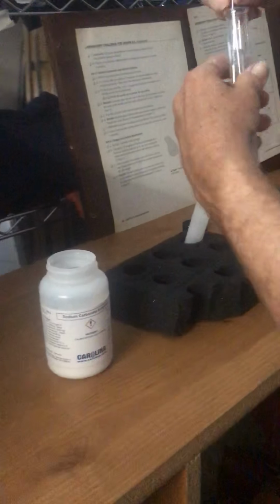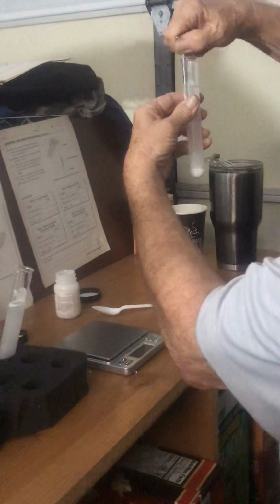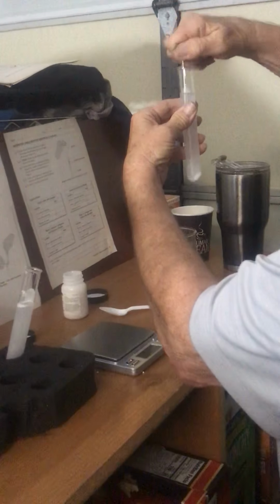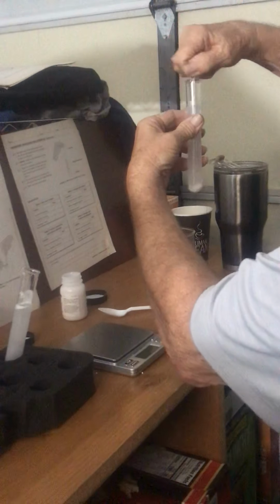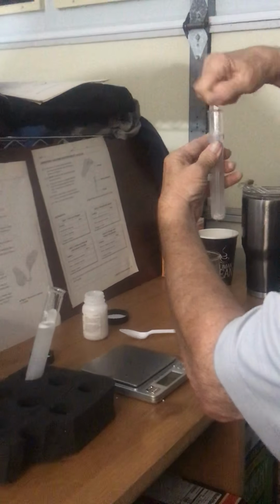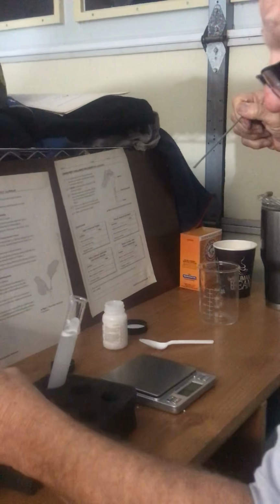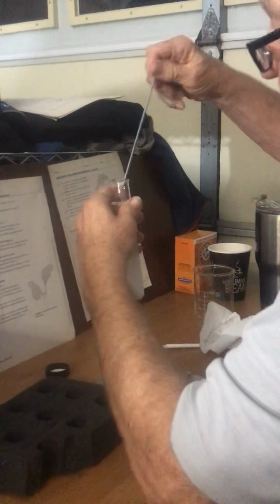And we're going to use our stirring rod to mix it up. All these things mixed up. Okay. Now the stirring rod. Back up. Mix this one up.